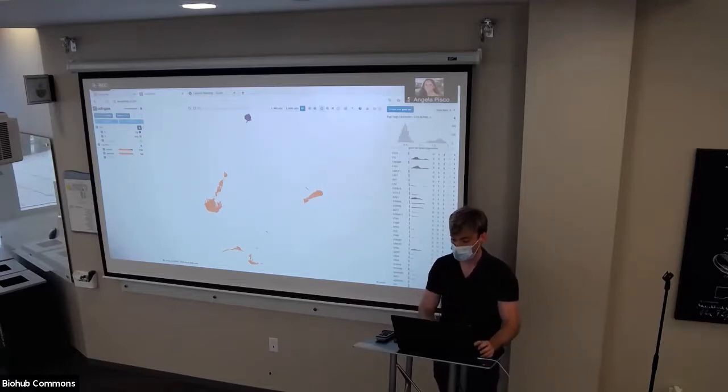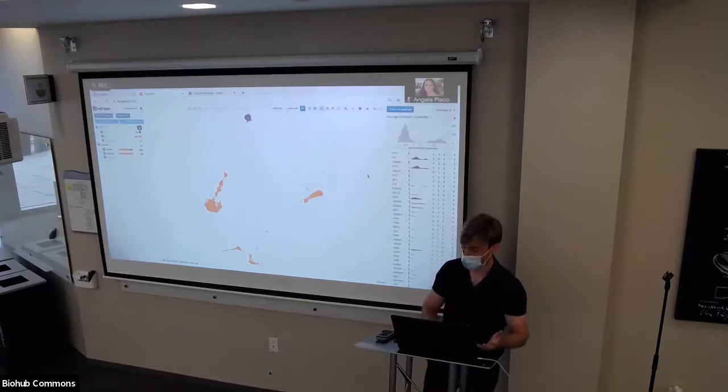So in lieu of that, I'm going to show you distributions of gene expression. What I did here is I circled this cluster, I did some differential gene expression, which I'll show you how, and it gave me a gene set. Each of these genes are presumably enriched in this cluster based on some statistical test. I think we're using the Wilcoxon rank sum test. But this is just to highlight what a brushable histogram is. These histograms are all brushable. Any histogram you see in cellxgene, whether it's continuous metadata on the left or these genes, you can click any part of the histogram and then drag.